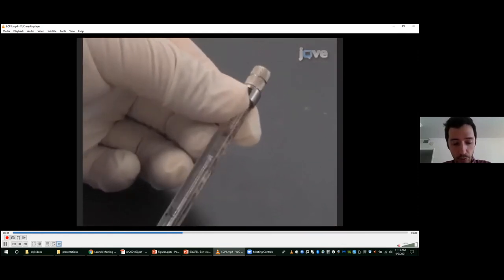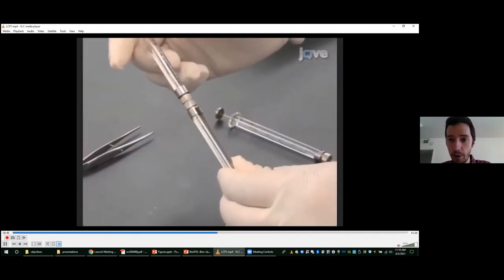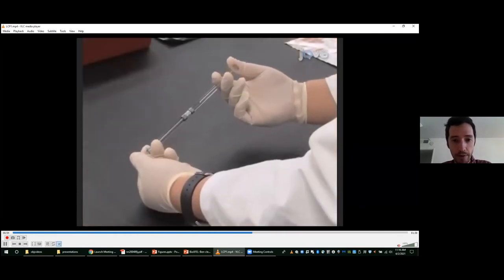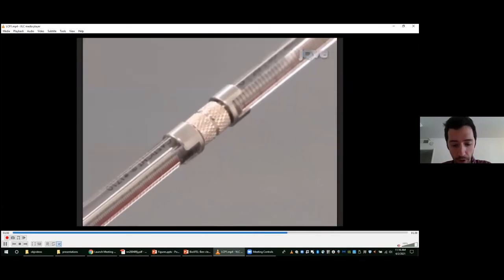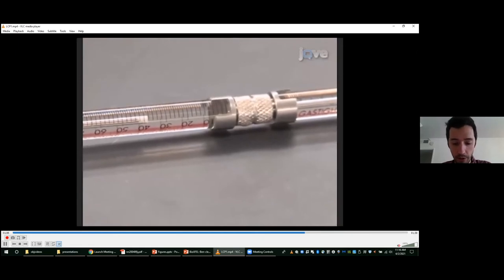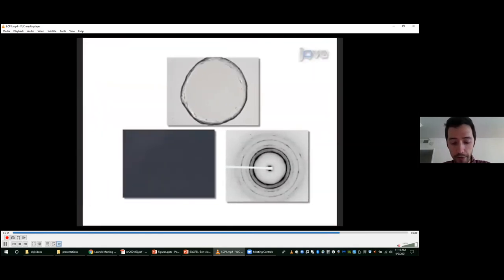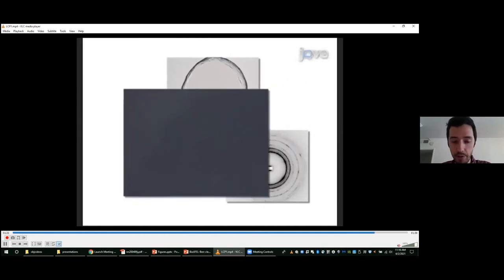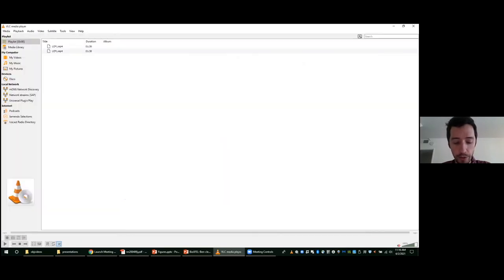We load protein and lipid into separate syringes and mix them in two-to-three volume-to-volume ratio: two parts protein to three parts lipid. Usually we would load the protein first and see how much volume of protein we have after concentration and then adjust the lipid volume accordingly. The syringes are connected with a coupler and mixed mechanically by moving back and forth until the phase becomes homogeneous and transparent, indicating the formation of LCP. LCP is transparent and not birefringent in itself. We can verify under the microscope the transparency and non-birefringence, as well as feel the viscosity when we mechanically mix it. This transparency and non-birefringence are sufficient to indicate LCP formation.